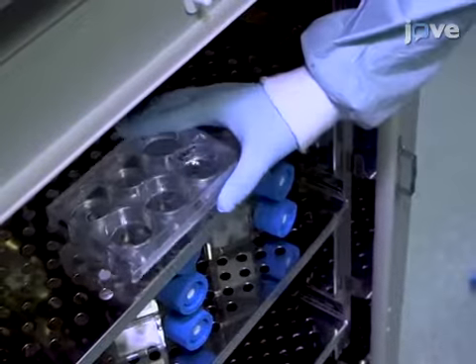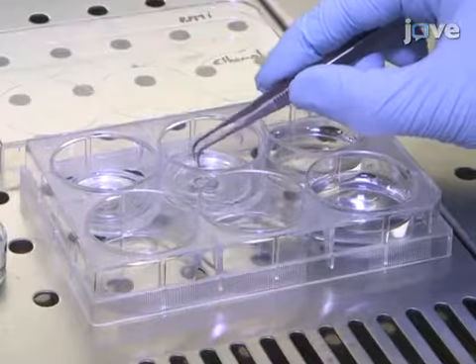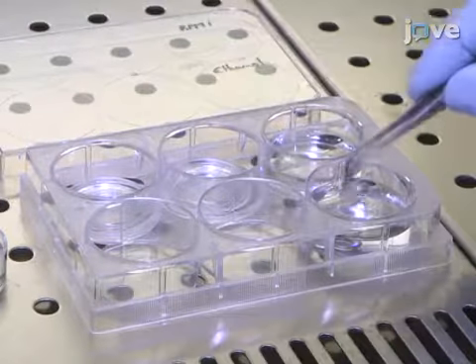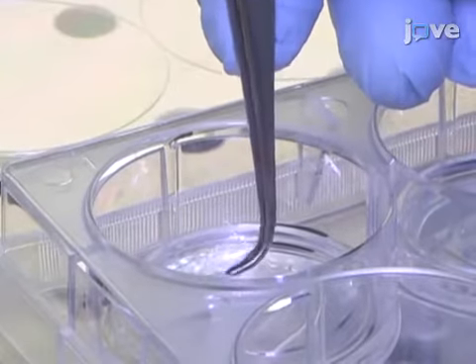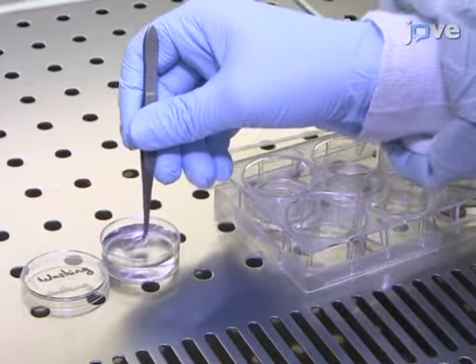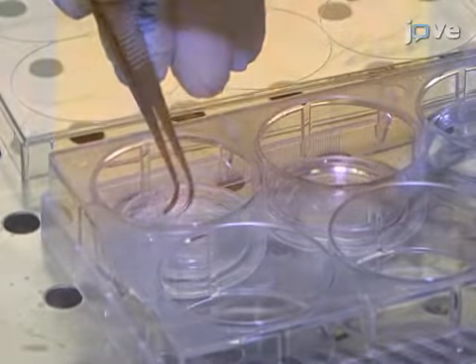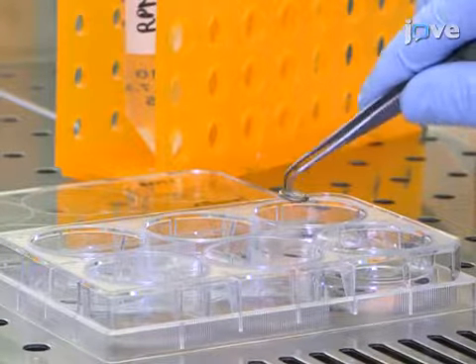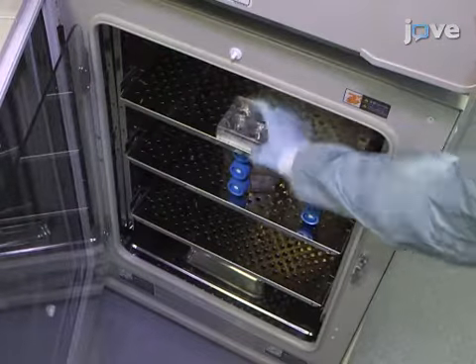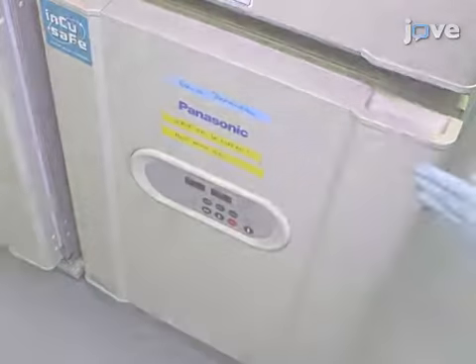To allow for staining, incubate the plate at 37 degrees Celsius for 15 minutes. After the staining step is complete, using fine forceps, remove the washers. Then, gently take out the slices and dip them in phenol red-free RPMI 1640 medium for 10 seconds. Place the slices back onto the cell culture inserts and add a drop of phenol red-free RPMI 1640 medium over each slice. Incubate the plate at 37 degrees Celsius for 10 minutes and then proceed to imaging.